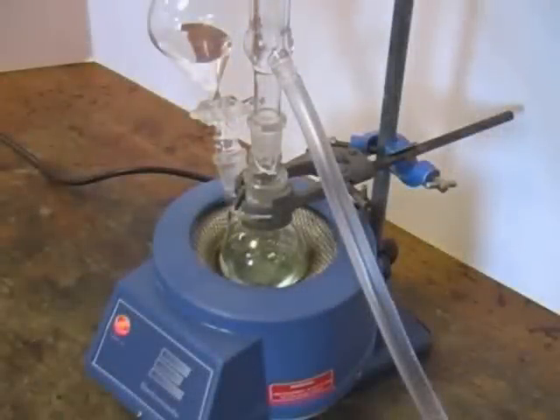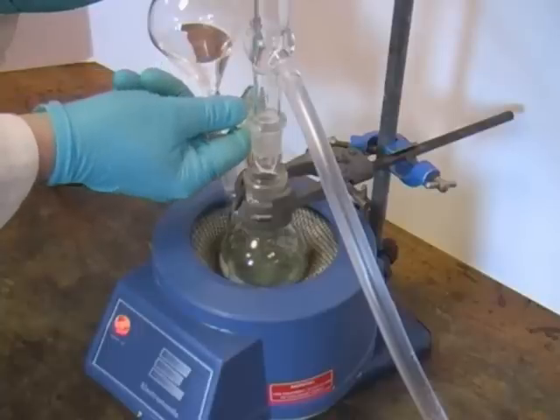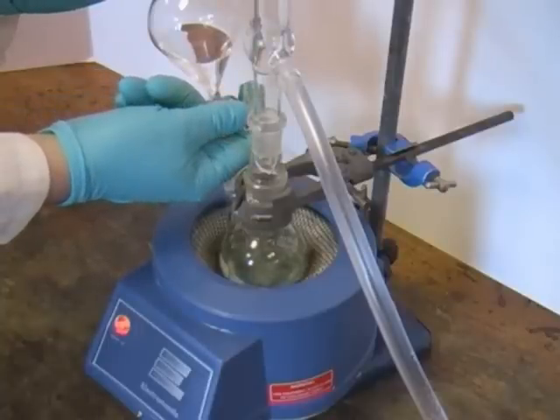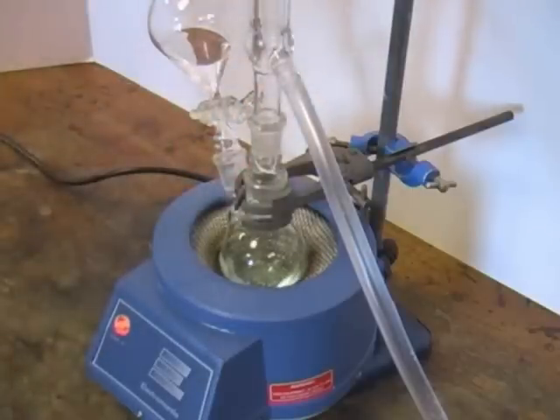With the reaction refluxing at a steady rate, we're now ready to add some of the reagent solution from the dropping funnel. We do this simply by opening the tap on the dropping funnel very carefully to ensure that the reagent is added slowly. If we add the reagent too quickly, we may cause the reaction to become out of control. So it's very important to make sure that you follow the instructions in your script.